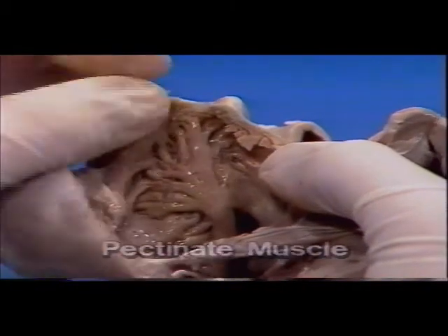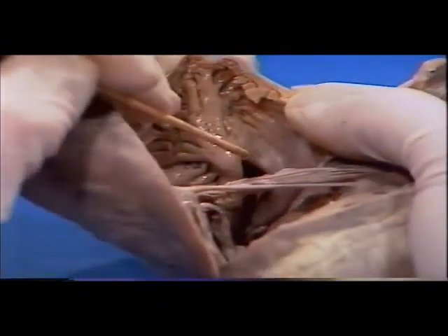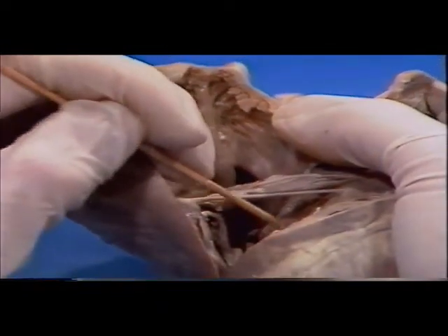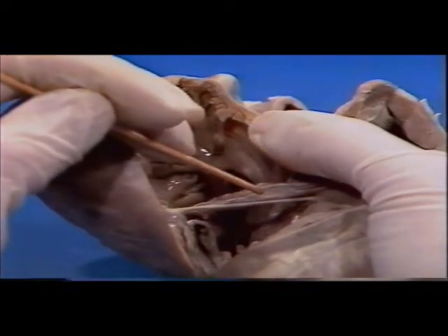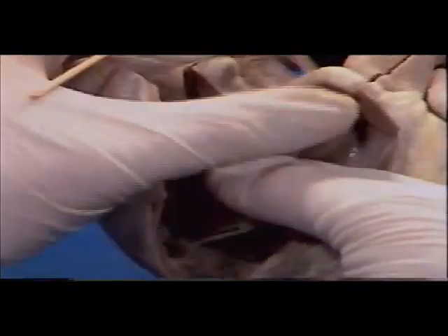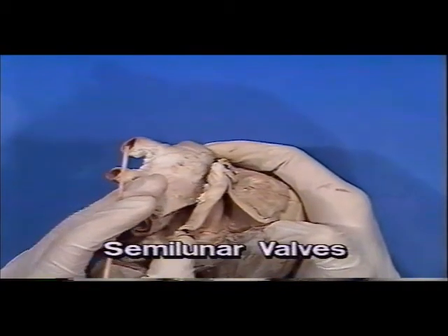Reaffirm that the atria are in communication with ventricles via the atrioventricular valves on each side. You should now open the aorta and the pulmonary trunk in this fashion in order to expose the semilunar valves.